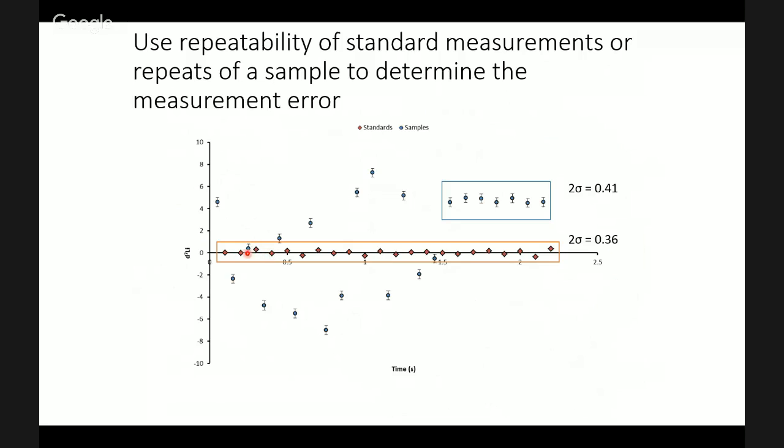Okay, and that variability through time is essentially how precisely the mass spectrometer can make a repeated measurement. Okay, so if you measure the same thing over and over and over again, what is the variability in that measurement? And we can measure the standard deviation of that and give 2 standard deviations, which is approximately the 95% confidence interval. Okay, and we can then start to use that to work out how precise our measurements are. So this is quite often termed the internal reproducibility of the mass spectrometric method.